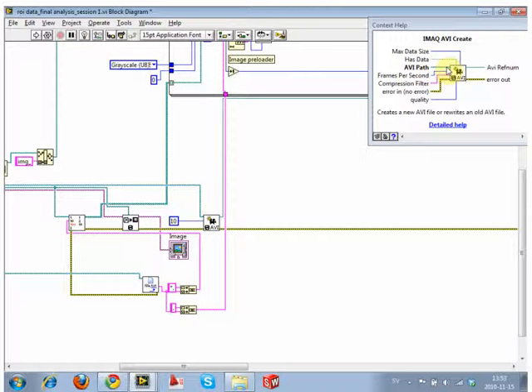Frames per second is very good to type in. You don't have to, but I would always write it in. And compression, for now, I would always just leave it blank, so then you never compress your data. I can show you specific techniques for compressing the data, but for now it's best to not destroy it. So we leave compression off for now. So here we make this AVI, so we built a container.